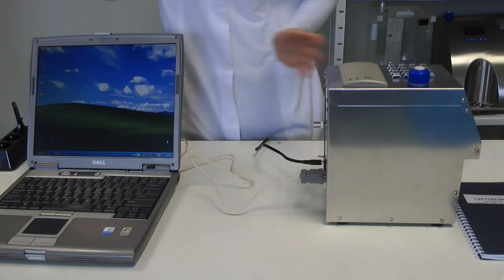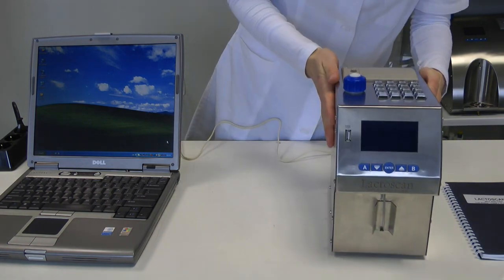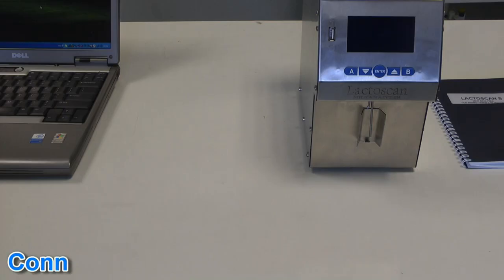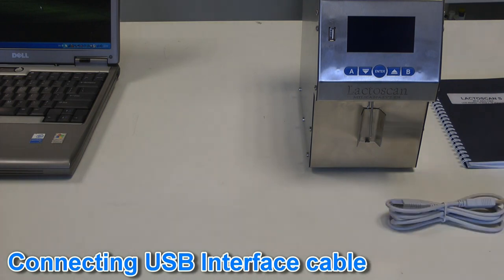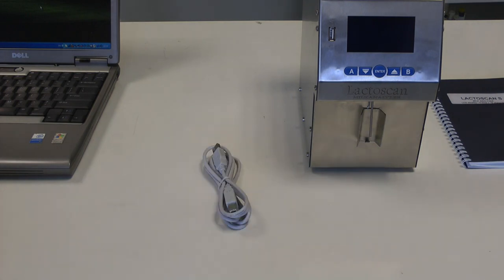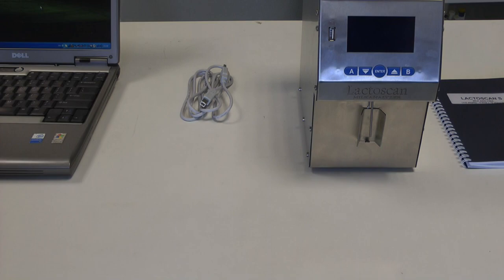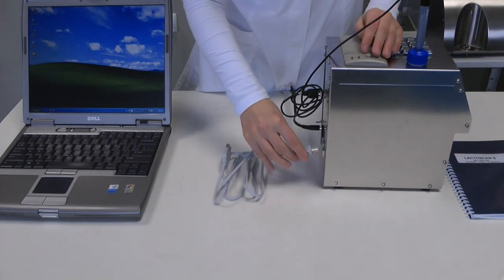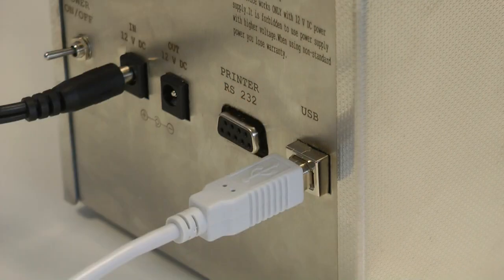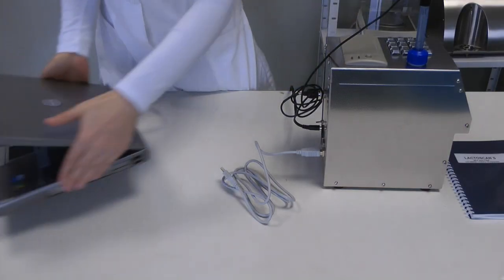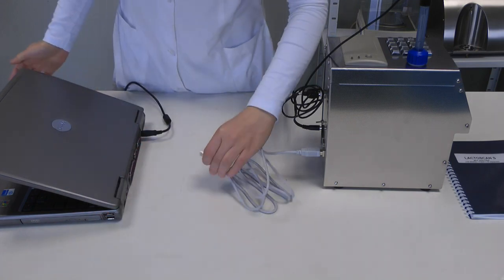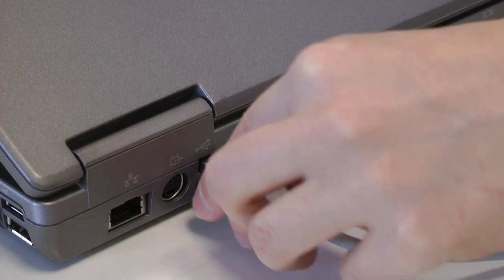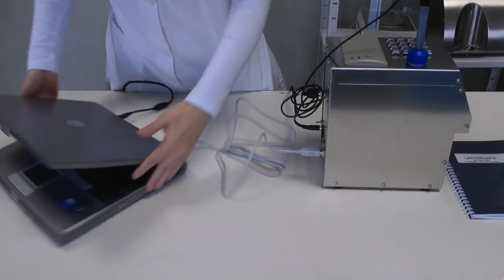There are two additional options for connecting which must be ordered separately. USB interface located on the rear panel of the analyzer, used for connecting the analyzer to portable computers where there is no standard interface as RS232. You have to install drivers available on the CD.